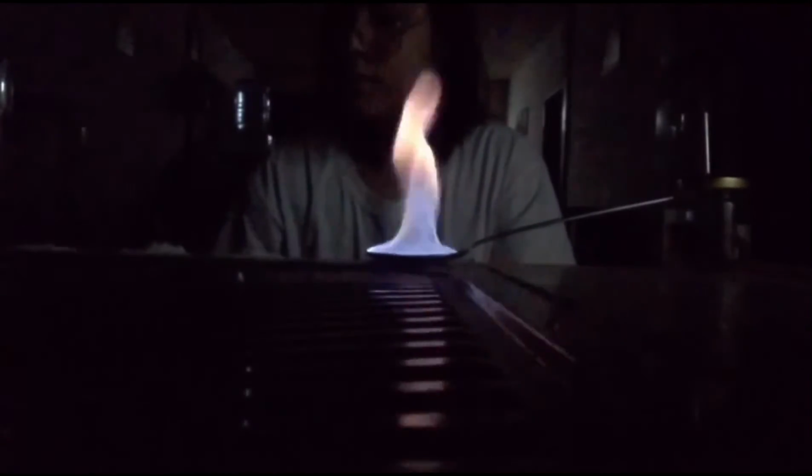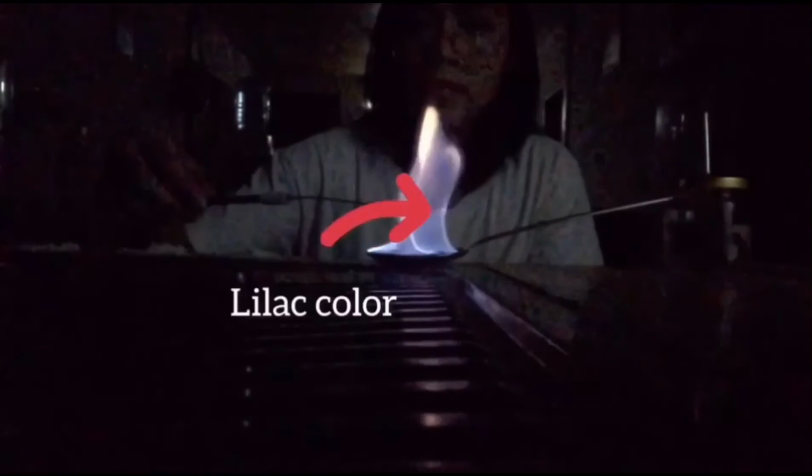The second chloride that I tested is the deodorant chloride. As you can see, there's a little bit of lilac color because deodorant powder is made up of potassium alum, and the color of potassium in the flame is violet or lilac.